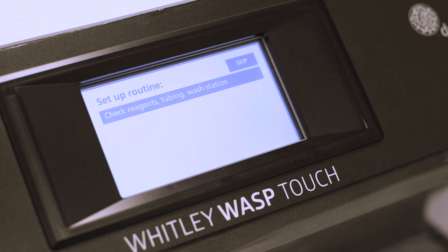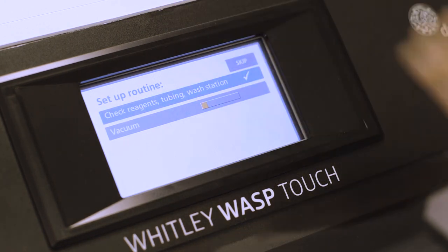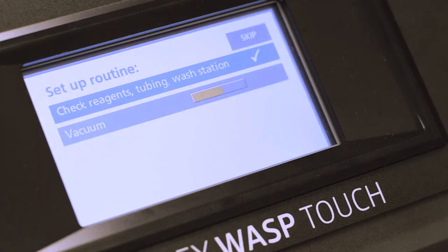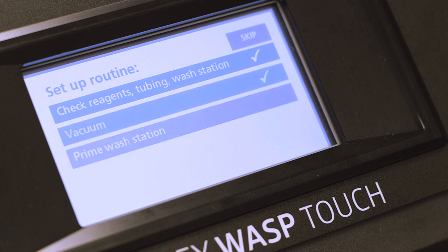Automated Intelligent Monitoring Software guides the operator through an automated set-up routine to make sure the system is primed and ready to use.